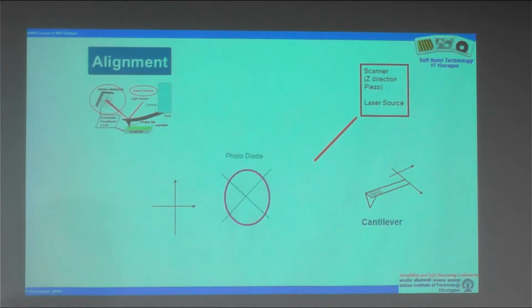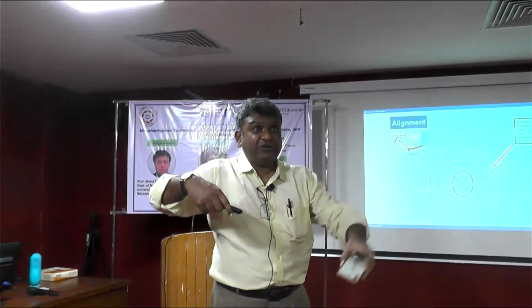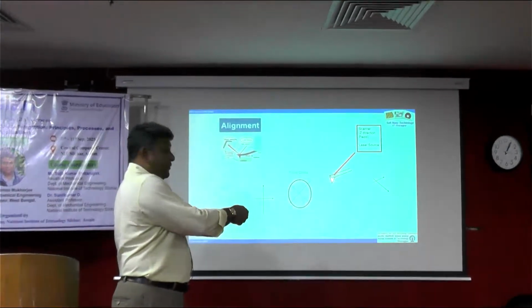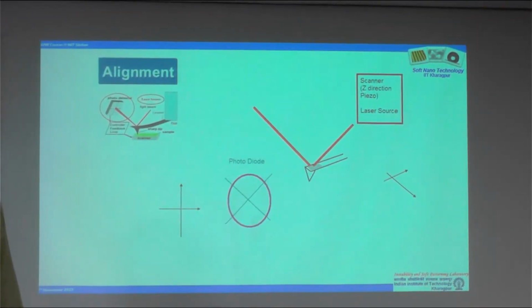They move in such a way so that, as I told, there is a reflecting coating over here. So basically, you move the screws in such a way so that the tip basically comes in the path of the laser light. So suppose I am shining this laser, right? And if I now bring in something in the path of the laser, firstly, you see that the laser is no longer falling at the floor. And secondly, instead of this cell phone, if I now have a shining mirror, the light will start to reflect from here. You remember that I told there is a shining area, micro mirror over here, which you bring in the path. So what is the consequence? Now the laser starts to reflect, right?